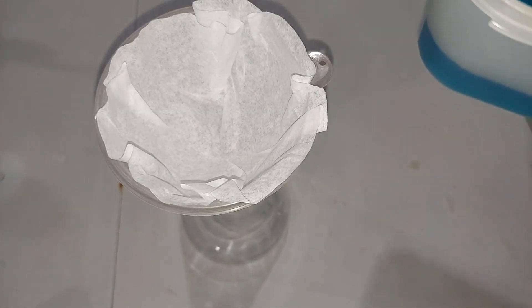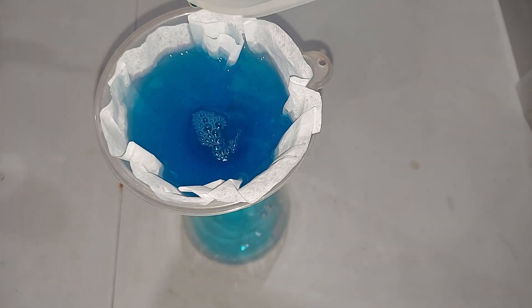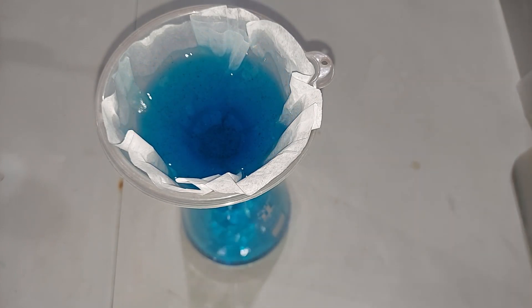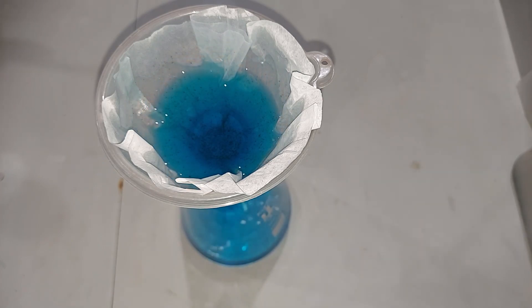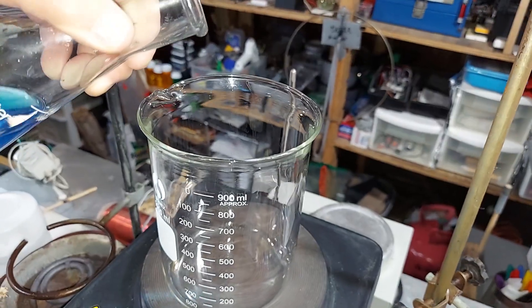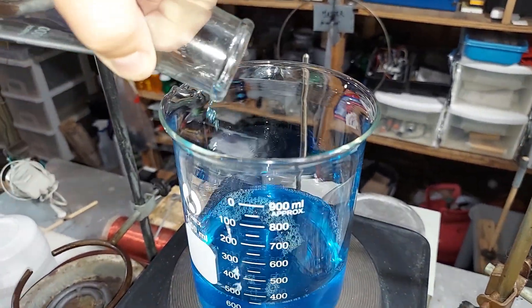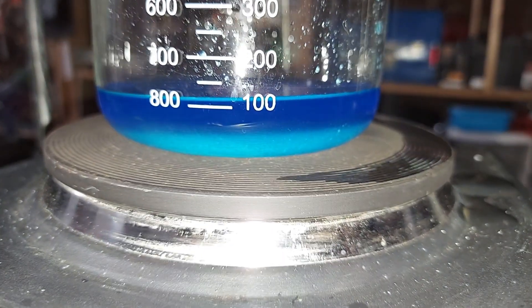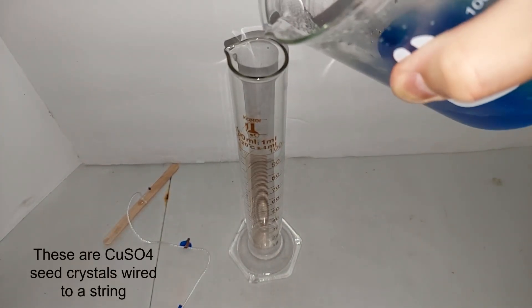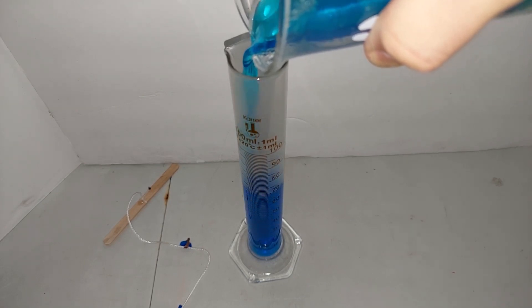Starting to filter this solution. I'm now transferring what we just filtered into a large one-liter beaker so we can heat it and drive off some water. About two hours later, it's almost at 100 milliliters, which is where I'm going to stop. For the last stage, I'm going to transfer that 100 milliliters into a 100-milliliter graduated cylinder, which will help not only cool but also concentrate the solution.